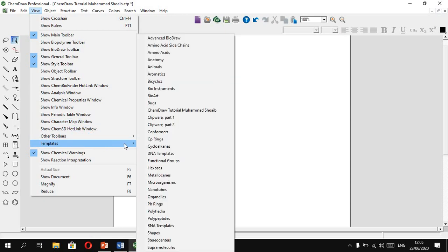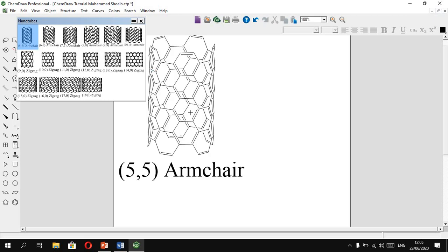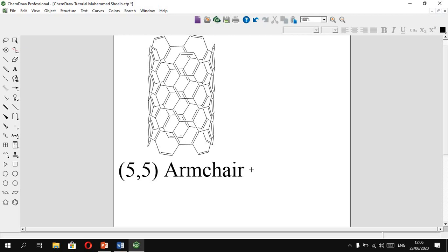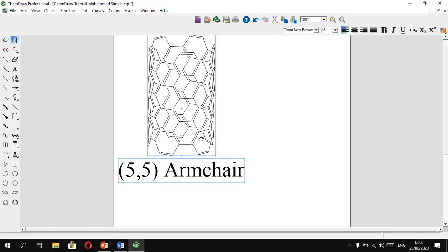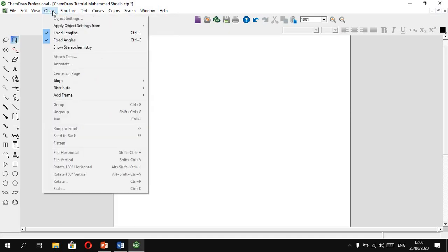Under Templates, there are a large number of templates which don't need to be drawn manually — they can be inserted directly. For example, there is a nanotube template. It is quite a difficult structure to draw manually, so we can use templates. If we want to remove it, simply use the marquee select tool, select it, and press Delete on your keyboard.